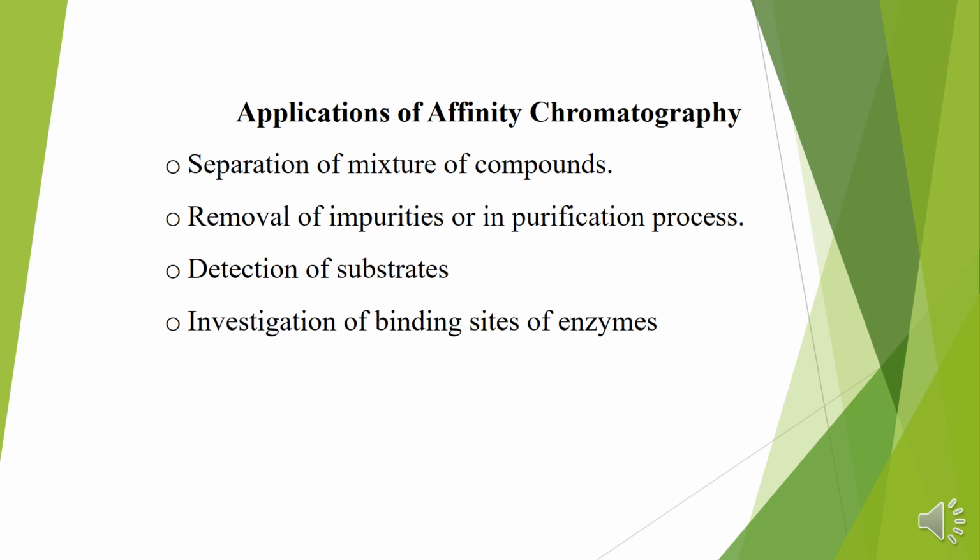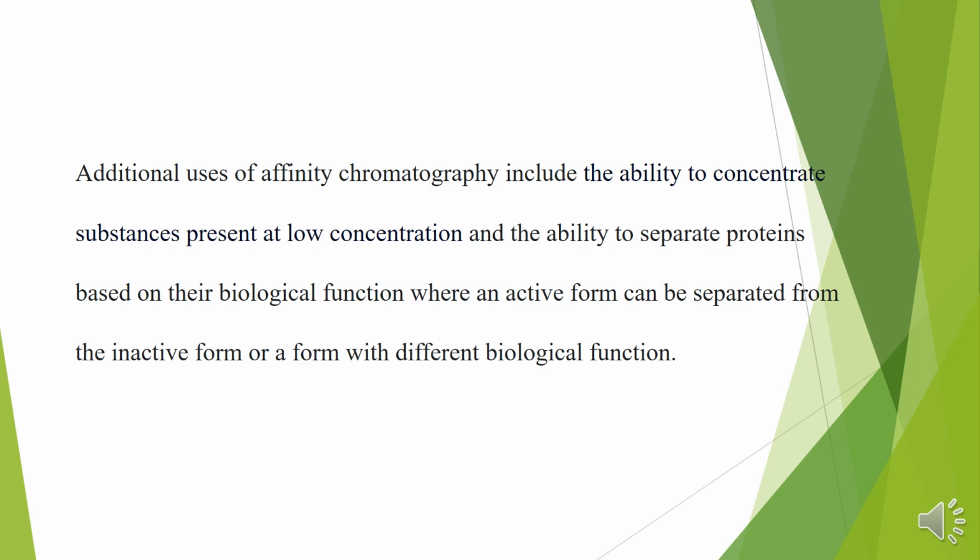Then, applications of affinity chromatography. Applications include separation of mixtures of compounds, removal of impurities in purification processes, detection of substrates, and investigation of binding sites of enzymes. Additional uses of affinity chromatography include the ability to concentrate substances present at low concentration and the ability to separate proteins based on their biological function, where an active form can be separated from the inactive form or a form with different biological functions.